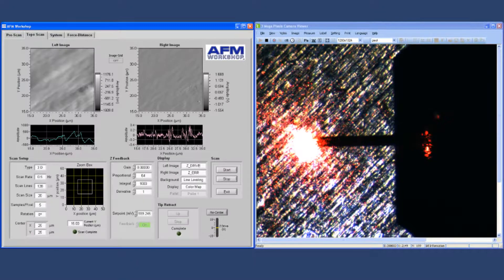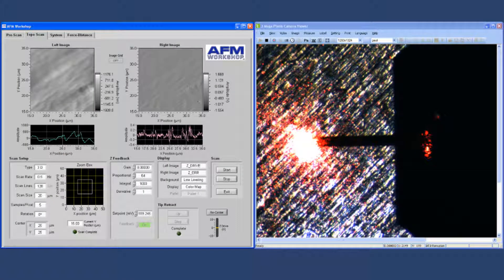The next tab is the topography scanning tab, and it's used for acquiring images with the microscope.